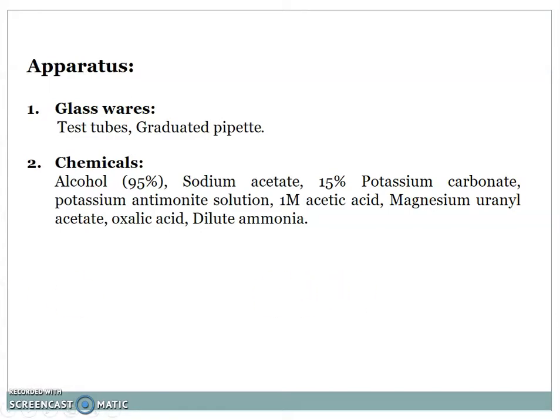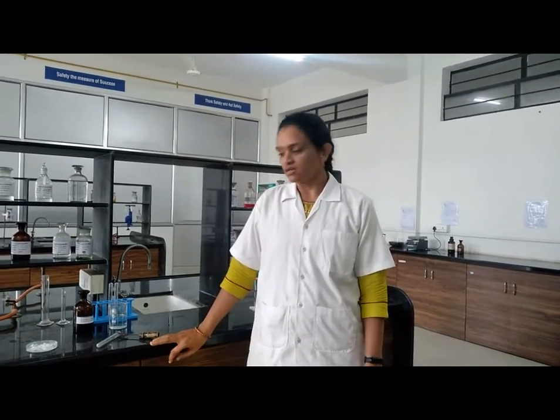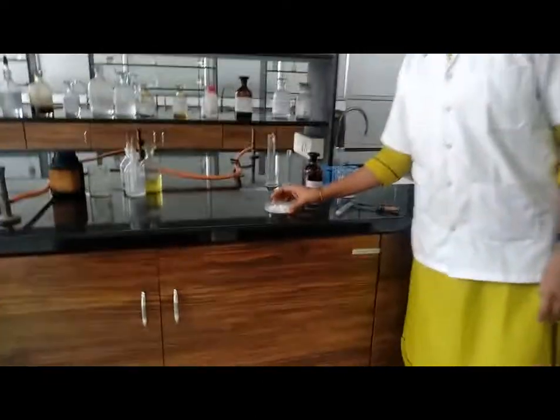For actual practical, we move towards laboratory. Here in our pharmaceutical chemistry laboratory, let's start with identification test. Today's aim is identification test for sodium acetate. This is our powder, a crystalline white colored odorless compound.